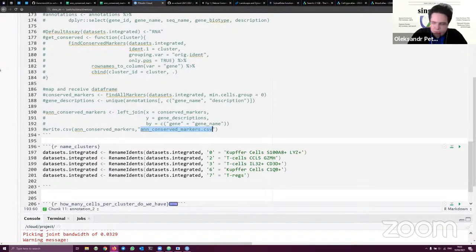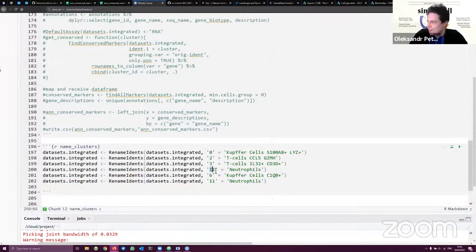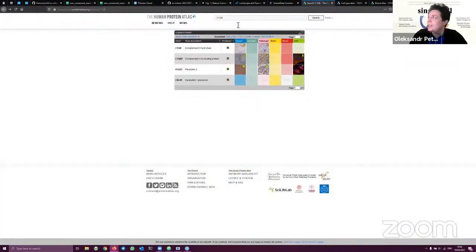Yeah, so we have a lot of input already. We will just mark a few more clusters and we'll go further. So cluster 11 is probably neutrophils. Works for me. Cluster 4. Okay, so this cluster is interesting. What do you think, Tatiana? Which cluster is that according to the specific cell name? Yeah, so it can be in the tissue, but which do you think is the cell name? So which specific cells are those?